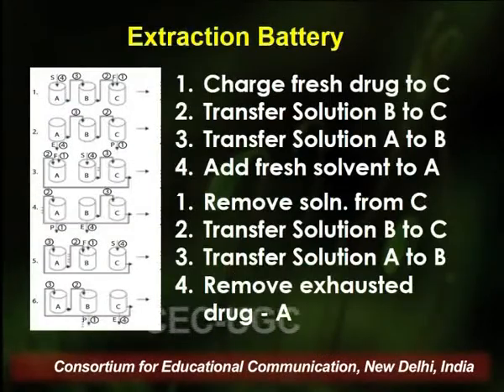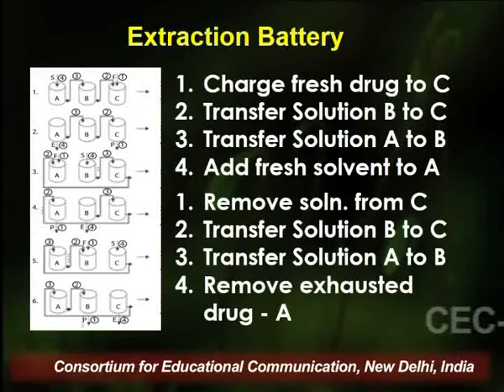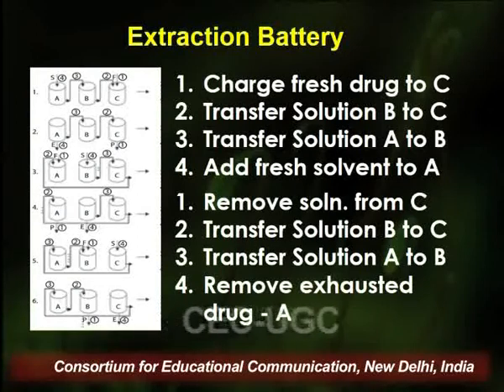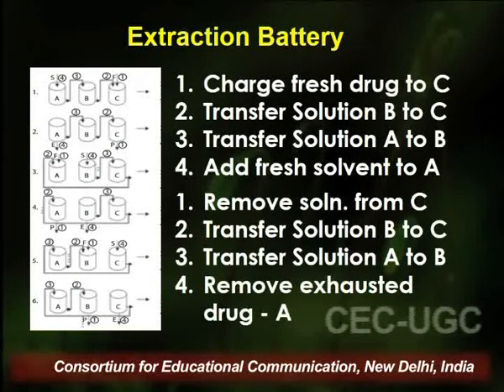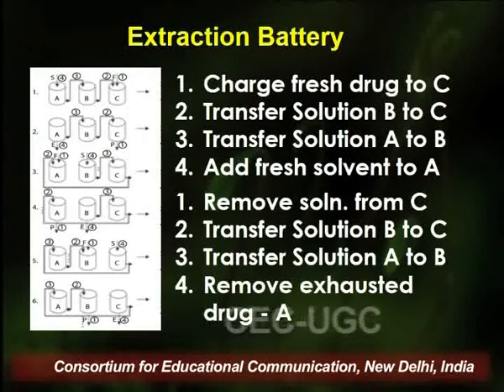So this multiple stage extraction has further been modified by using an extraction battery. In this picture you can see there are 3 containers. I have taken an example of the simplest form of the extraction battery. Now the major advantage of the extraction battery is all these 3 containers are attached to each other with the help of pipings, and you can remove the contents of any of the containers at any given time period.